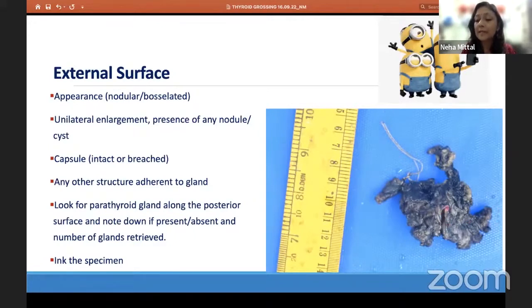And what you see here as a slit and something that is seemingly questionable, whether it's a lesion or not, is actually a thyroglossal cyst, which has been diagnosed, and this is a thyroglossal cyst seen on the anterior aspect of the thyroid. And later we will see more sections of the more grossing of this very specimen.